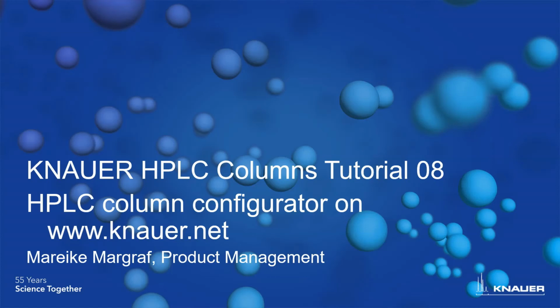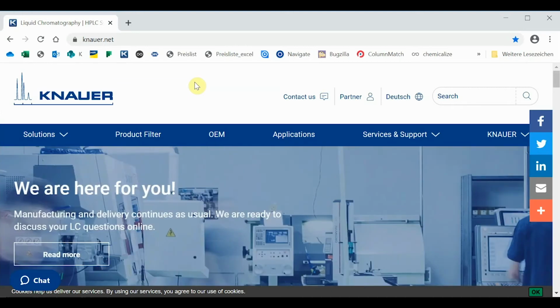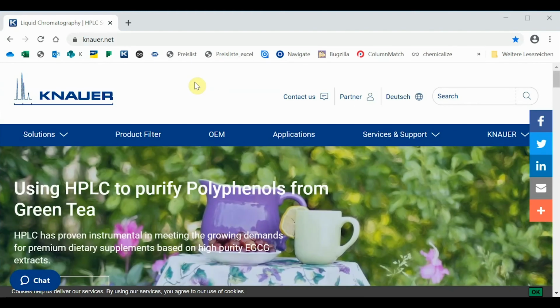Welcome to KNAUER HPLC Columns tutorial with the topic HPLC Column Configurator on the KNAUER webpage knauer.net. In this video, I want to show you how to work with a product filter for columns, the so-called column configurator on the KNAUER web page.